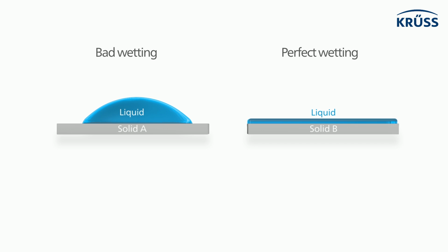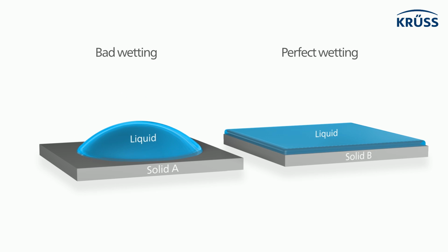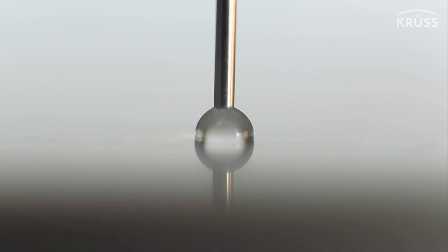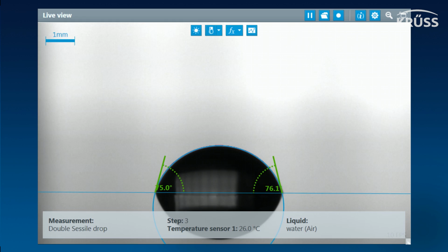Test inks do not consider these interactions. Therefore, they can hardly detect the actual effect of pretreatments. Contact angle measurement is the widely accepted method to measure surface-free energy. With this method, a drop is placed on the surface, and the drop shape is precisely analyzed using a microscopic technique and sophisticated image analysis to determine the wetting quality.